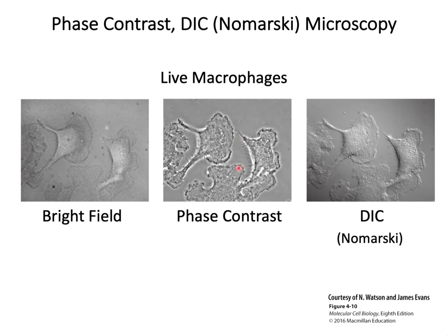See the comparison of the bright field microscope versus the phase contrast image. You can appreciate the detail gained at the intracellular level. Phase contrast microscopy capitalizes on different refractive indices of cellular components and gives greater detail of the organelles. In contrast, you can see differential interference contrast, or DIC, or Nomarski microscopy.